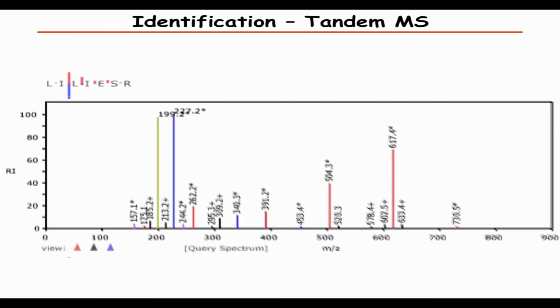We want to be able to label all the peaks, whether they're Y or B ions, and between which amino acids the fragmentation happened. And we want to be able to annotate the sequence and show how much evidence we have for fragmentation between different amino acids.